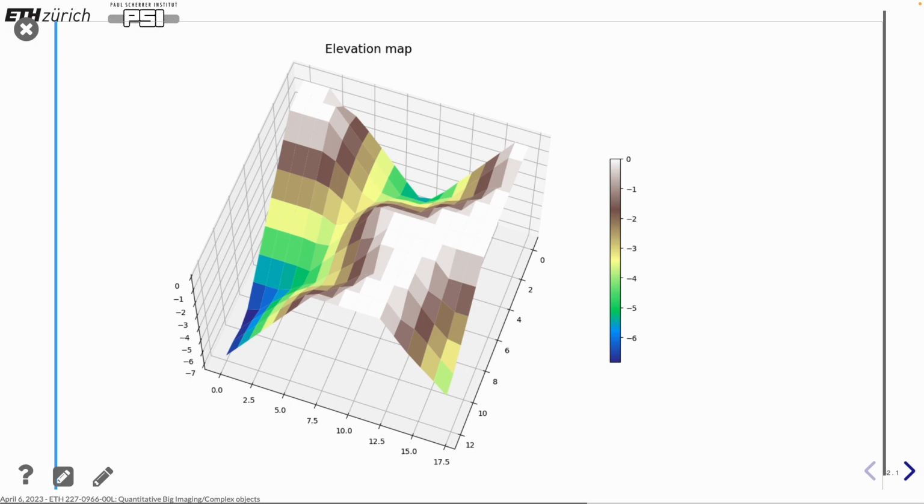And even with this nice color map, we can get it looking like a landscape. That's just coloring, and it happened to be very nice. But what we are looking for now is a way to separate the 2 items. We have one item here with one catchment basin and one item over here with another catchment basin.